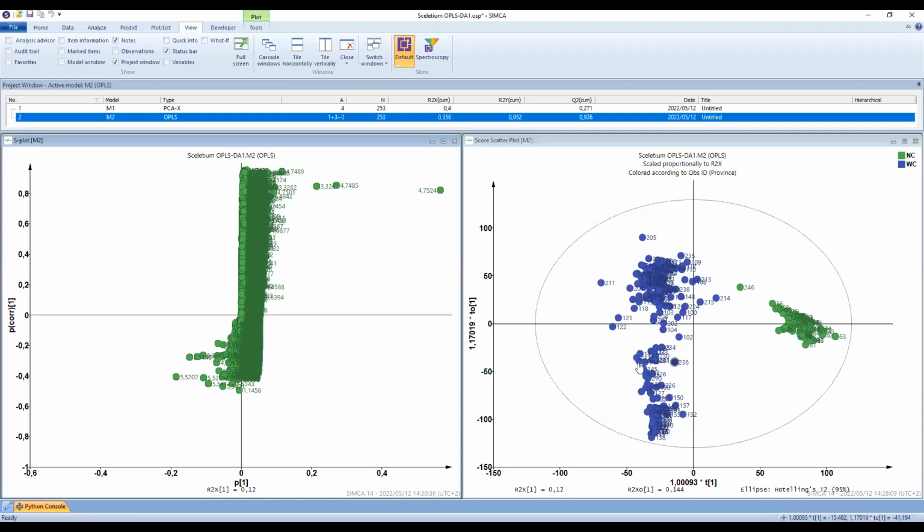Okay, the same applies here. With the blue, we don't have a lot of variables here. We have the 5.5, and this could be because we actually have clear separation here. So it means that there's so much variation between these that we can't find a lot of compounds that have clustered them together. So there's probably one that occurs in all of them, and the difference is probably just quantitative, and that's why you don't have a lot of variables. But the 5.5, you can clearly see that it probably occurs in your Western Cape samples more. Okay.